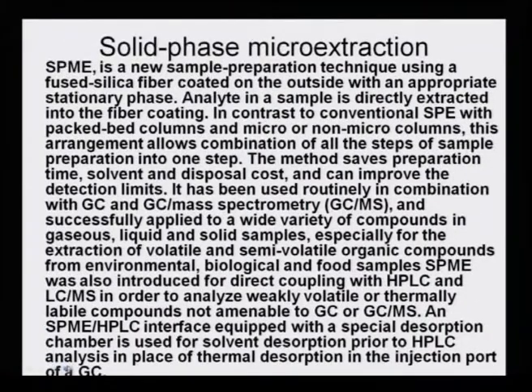So, we have just spoken in detail about solid phase microextraction, and it can be directly linked up with GCMS, that is gas chromatography mass spectrometry, and that is its advantage, that there is no contamination. The analyte in the sample is directly extracted into the fiber coating, in contrast to conventional solid phase extraction with packed bed columns and micro and non-micro columns. This arrangement allows a combination of all the steps of sample preparation in just one step.